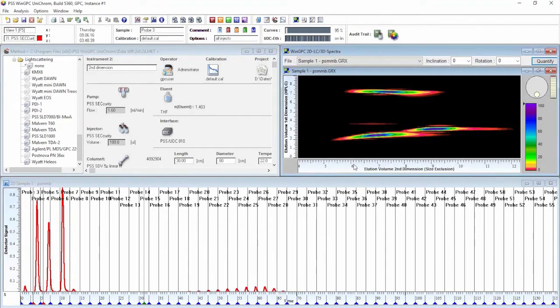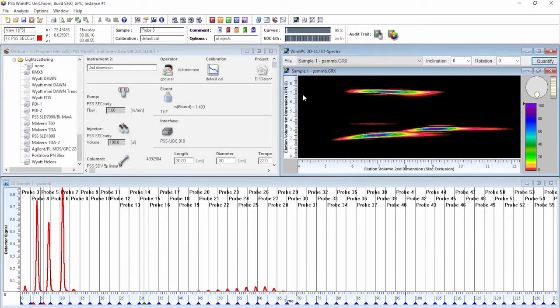Transferring the chromatograms to the 2D window, we can build up a contour plot. On the X axis we have the molar mass axis corresponding to size-based separation, and on the Y axis is the separation according to chemical composition. The colours represent the intensities of the peaks.